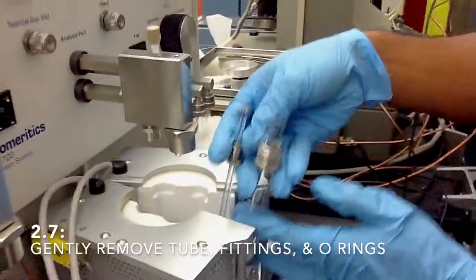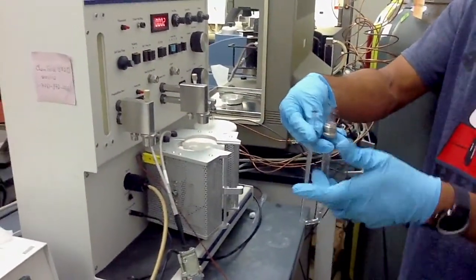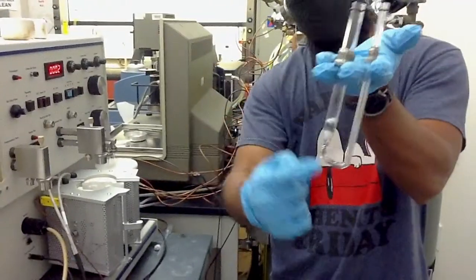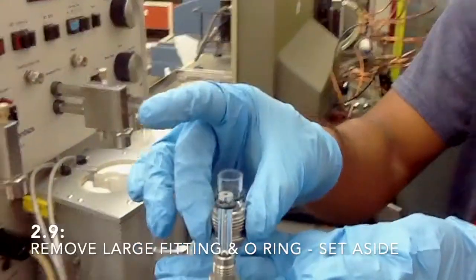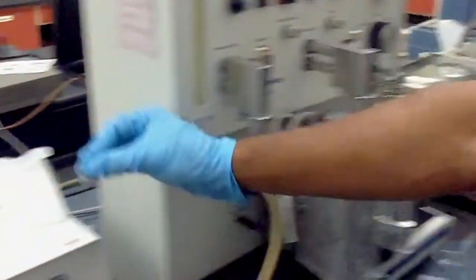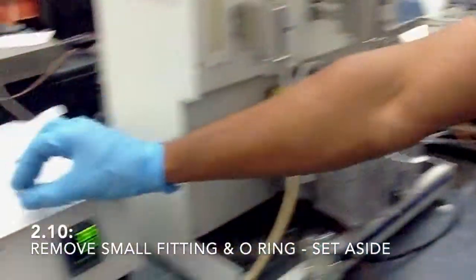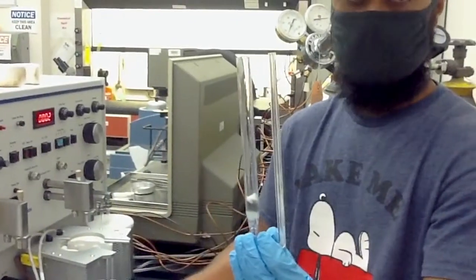And then there is one O-ring here and this too. Place your finger here, because you don't want to drop this. If you drop it, it will break here. You have to take this O-ring and this fitting out. Be careful with that and keep it on the side. I would like to keep it here. You can keep it anywhere, but don't lose it. Second, same thing, keep it by the side. So now your sample tube is ready to clean up for the new experiment.